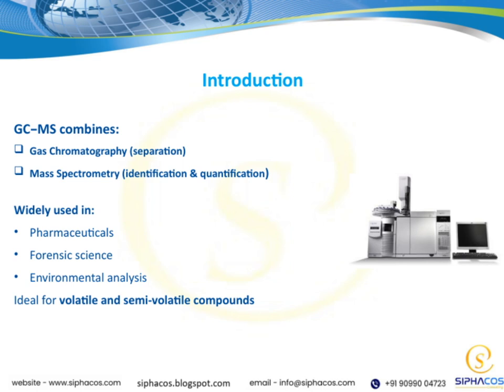For example, in pharmaceuticals, it helps analyze drug compounds and ensure quality control. In forensic science, it's essential for detecting and identifying substances in criminal investigations. Environmental analysis also benefits greatly, as it allows us to detect pollutants and trace chemicals in the environment.